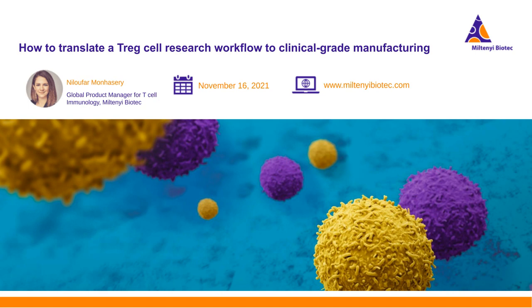Thank you. Next question. Is it possible to use Tyto sorting after isolation of the cells with CliniMACS Plus? Yes, I think you can. There are some teams in the field that are sorting their cells after enrichment with CliniMACS Plus.